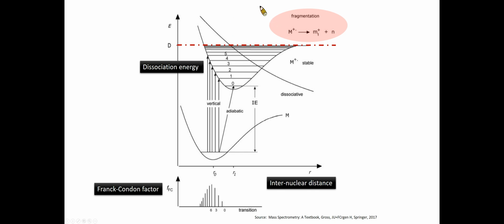No matter where the electron has formerly been taken from, ionization tends to cause weakening of the bonding within the ion as compared to the precursor neutral. Weaker bonding means longer bond lengths on average, and this goes with a higher tendency towards the dissociation of a bond.